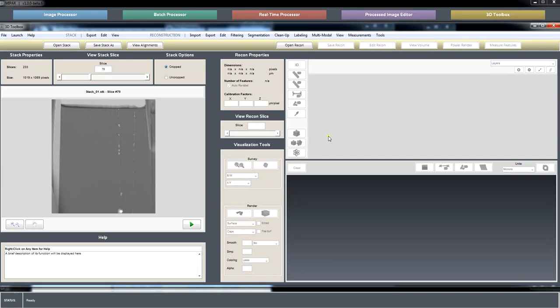If you have a bunch of random features, they can kind of govern their own alignment, but if you have inclined features, they might artificially get straightened out by the alignment process. So it's kind of to your benefit to use a field of view that has basically a fiducial marker, which is the area of the cross-sectional area and its boundaries.